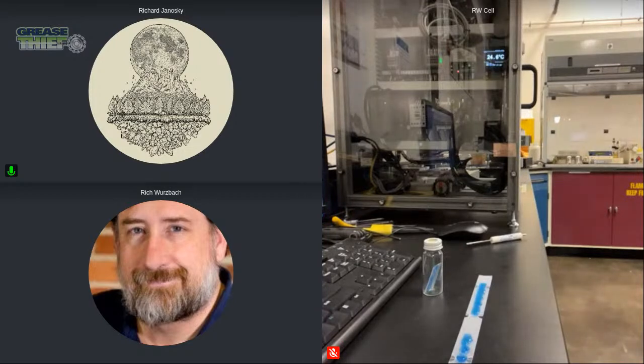And the other thing that I think we ran into with those is we did a preparation where it was a non-uniform layer. So there was a pea-sized glob of grease put in the middle of the substrate, which was the same amount as the thin film that covered the whole entire substrate. And we saw the difference there where if you had a clump of grease and it wasn't spread out thinly, you might have an issue of being able to drive off the moisture out of the grease in an efficient manner. And then you might not get all of the moisture counted by being able to drive it off in a quick manner in the instrument.